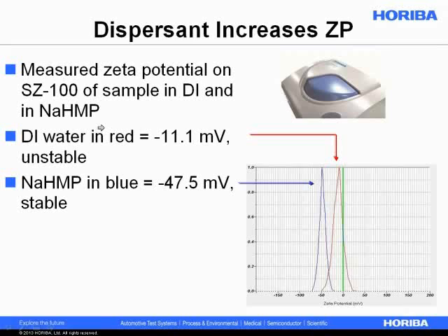It's a wonderful instrument. But what I used it for in this study was to measure the zeta potential of the sample just in DI water.